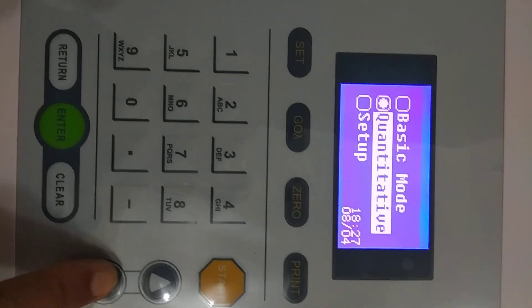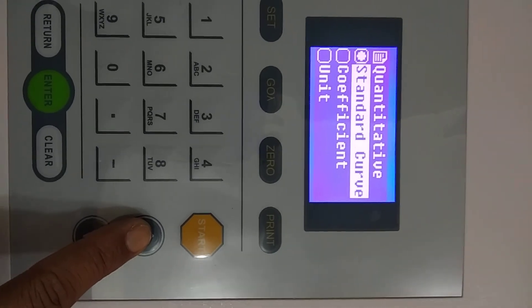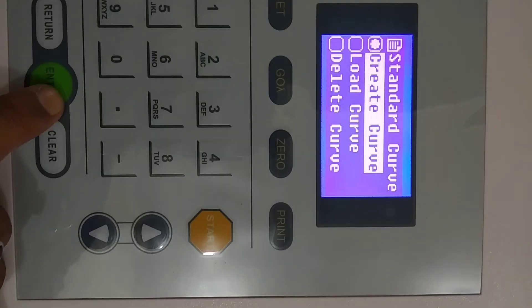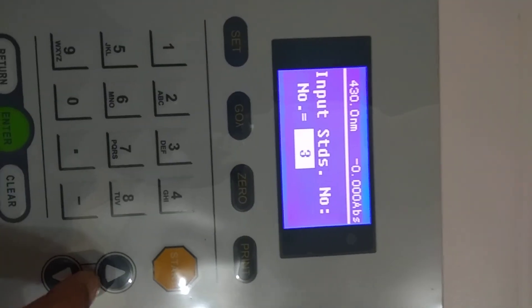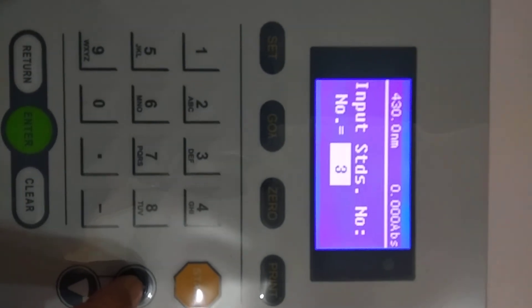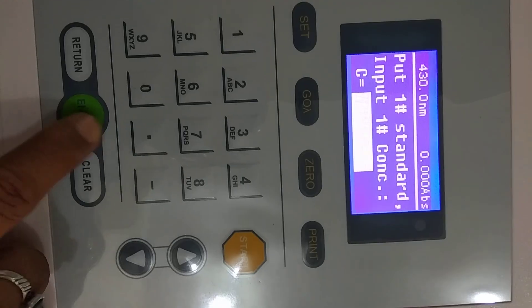Press Return to go back to the main menu. The second option is Quantitative Mode — press Enter. In this mode you can plot a graph of absorbance against concentration. Select Create Curve and press Enter. You need to input your standard samples — a minimum of two standard samples are required for plotting the graph.